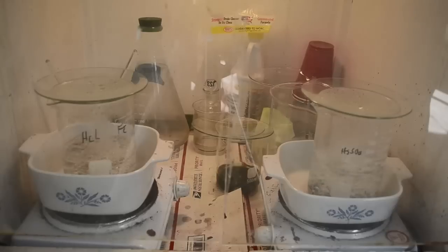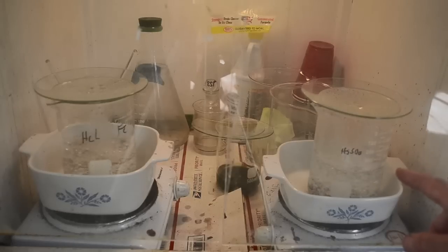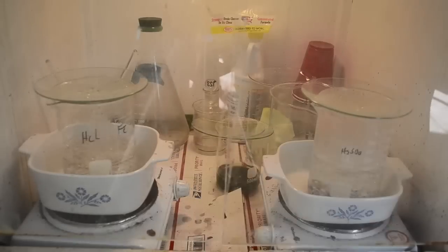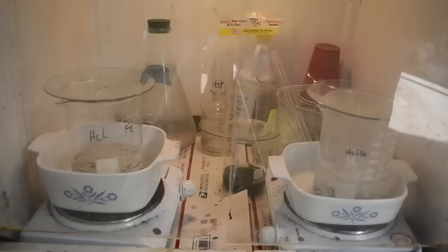Okay, both beakers have come to a nice boil. The sulfuric acid one came to a boil first. I don't know if it's a difference in my hot plates or just that this was hot already from putting some sulfuric acid in it, but it came to a boil a few minutes before that one. I'm going to let these go for a good 15, 20 minutes at least, and then shut them down. Now, my eyes might be deceiving me, but I do believe this one is a tiny touch blue. I'm not seeing it over there. Could be, I don't know. We'll see.